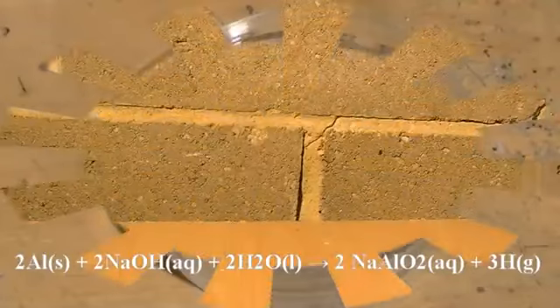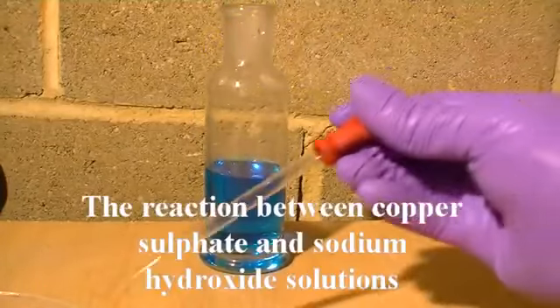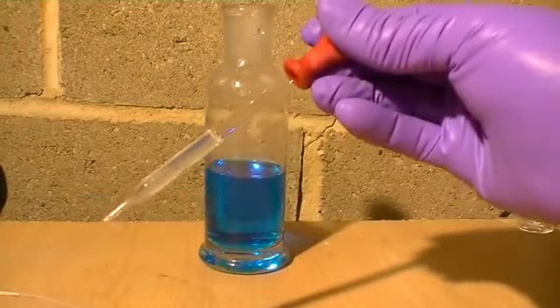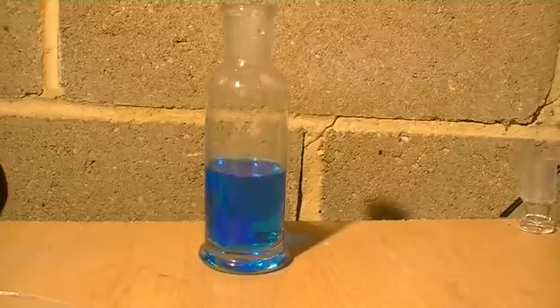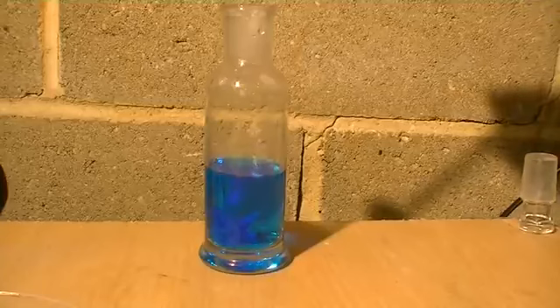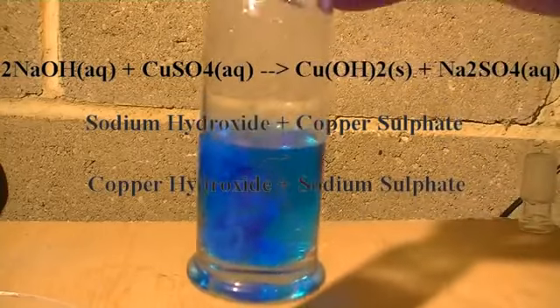In our next demonstration, we're going to see the chemical reaction between solutions of copper sulfate and concentrated sodium hydroxide. Concentrated sodium hydroxide solution is going to be pipetted into the blue copper sulfate solution. When these solutions meet, you can see a precipitate is formed. This is a double displacement reaction, and the precipitate formed is copper hydroxide.